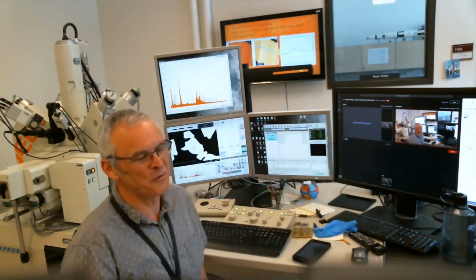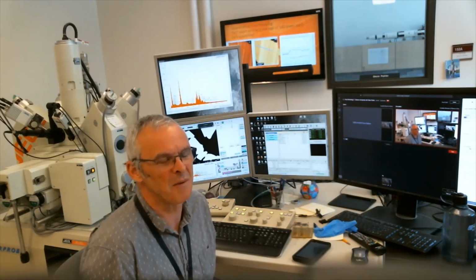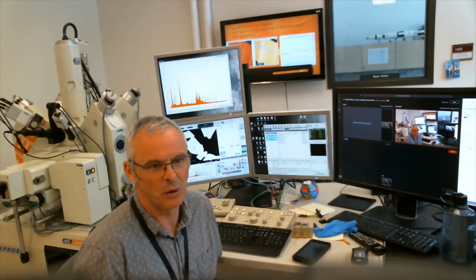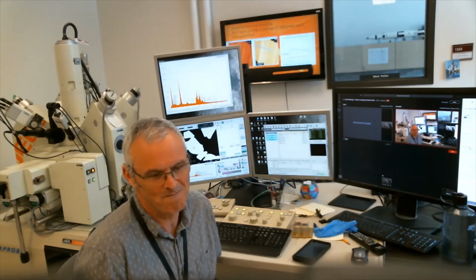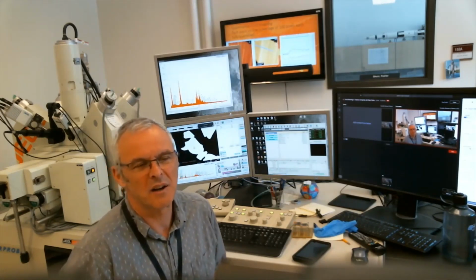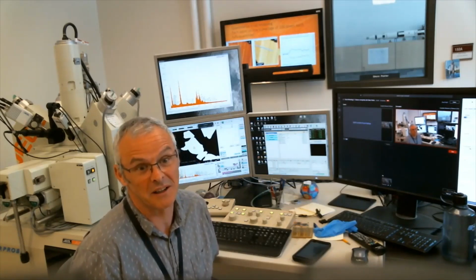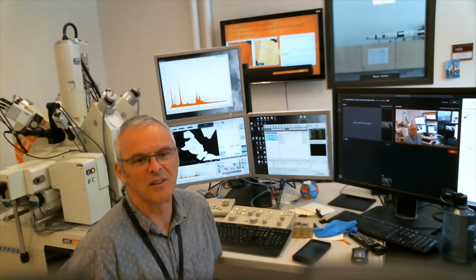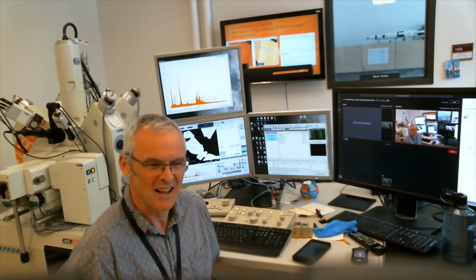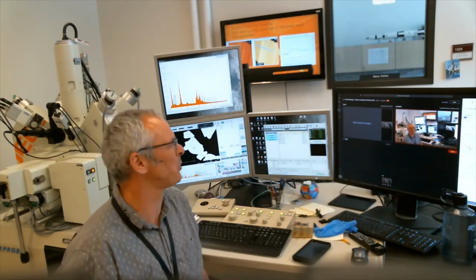So Ray, yeah, to get the true species name, you pretty much need a probe. Some of them you can sometimes tell by the shape and stuff like that, but the gold standard is pretty much microprobe. EDS probably could do it in a lot of cases, but there's a lot of funky things you need to do with stoichiometry, and probe is typically the way to do it. But like I say, not always. You can get a pretty good idea what the name is, but to get a name in the sense of the International Mineralogical Association, you need a microprobe analysis.